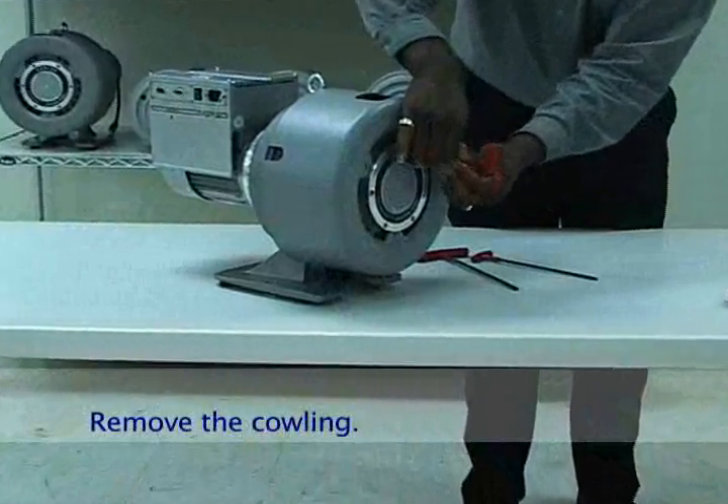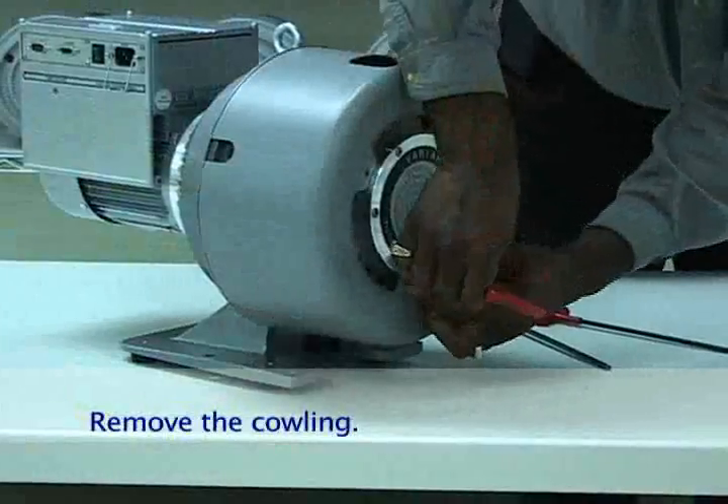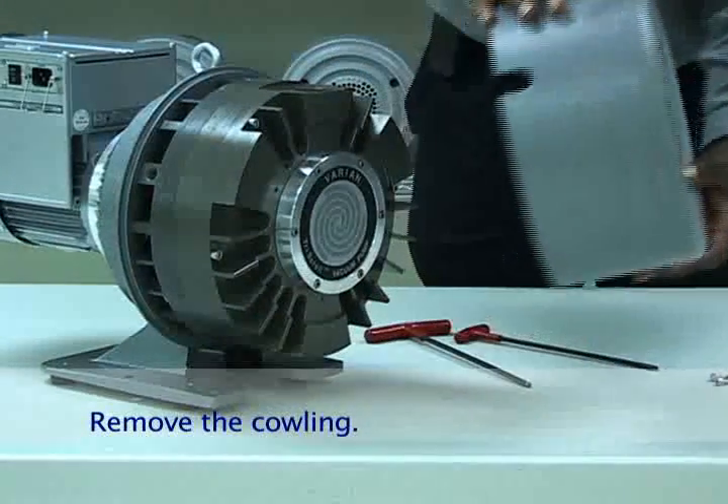After the inlet assembly has been taken off, remove the three M5 screws that attach the cowling to the module. Pull the cowling off and set it aside.